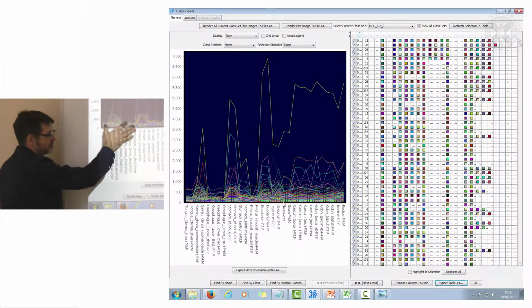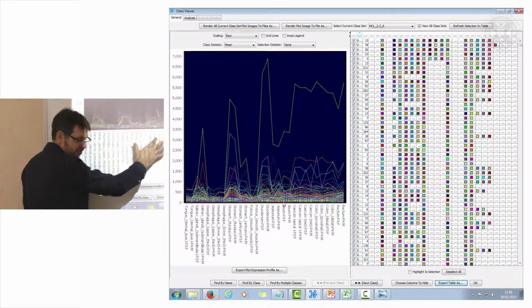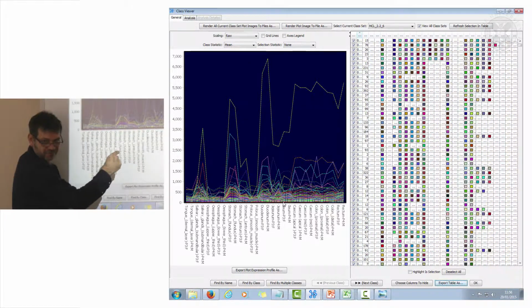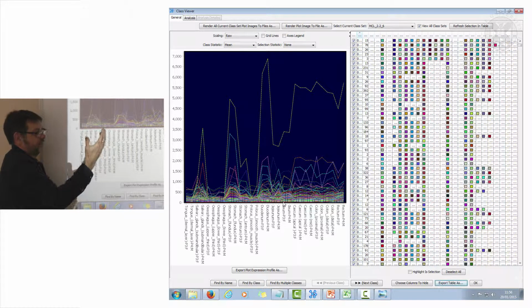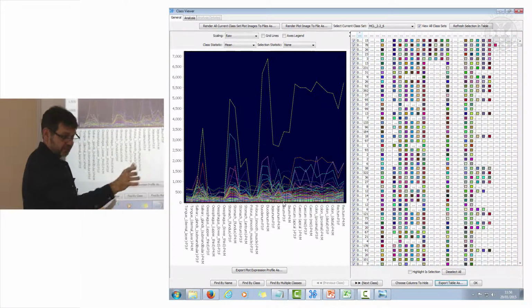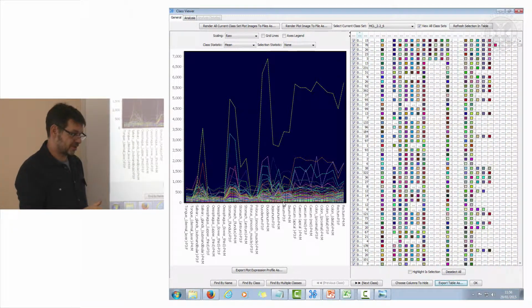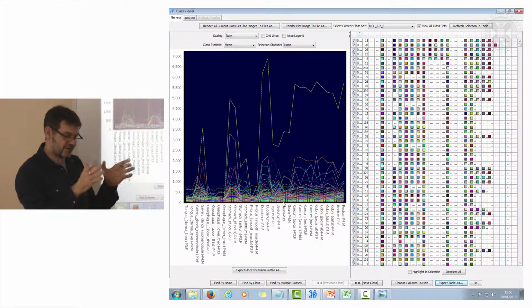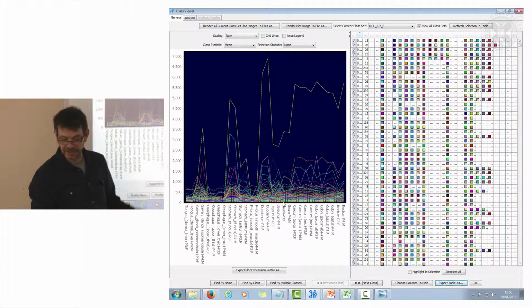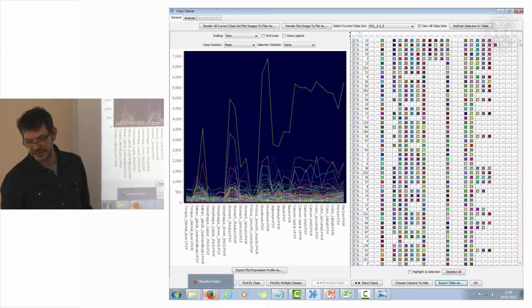The thing I like about this tool is I can actually see my data. I can see where the replicates are and I can use those replicates to plot. So even if only 2 of them worked, I know that there's a duff replicate in there. It didn't work, that replicate. I know that, and I understand that the 2 on the other side work beautifully and replicated, and I can possibly consider saying I only ran 2 replicates because I know one of them didn't work. So it's very useful to look at that raw data and to understand how replicates are working and to look at that primary data.